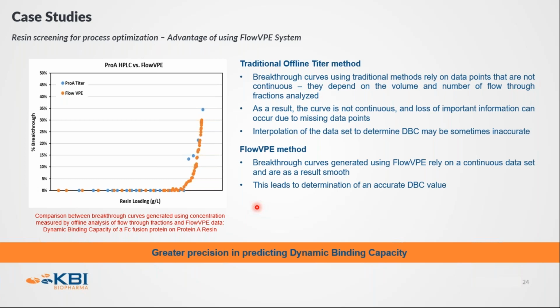And then what kind of maintenance do you do between cycles? We just make sure that we are cleaning the flow cell properly, because there is a chance that the spent medium can go into the fibrette and precipitate in the flow cell.